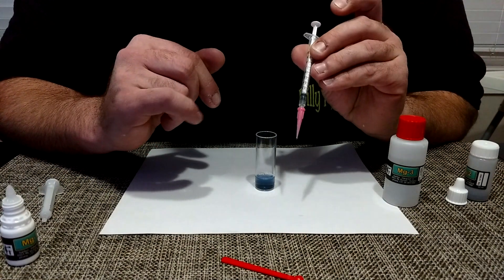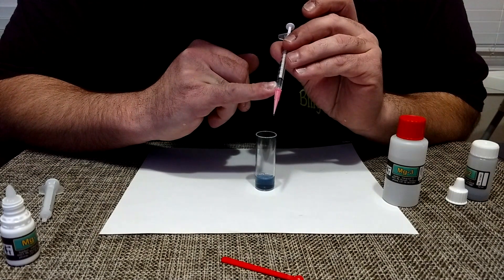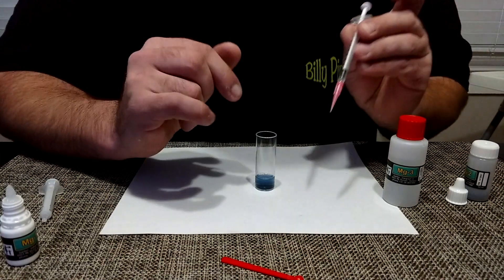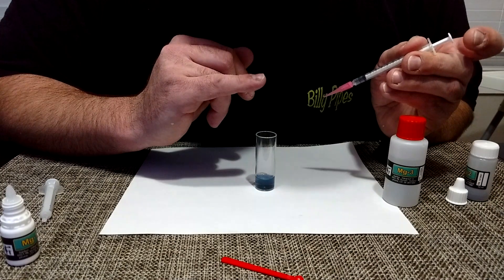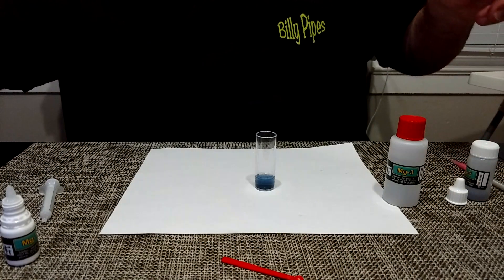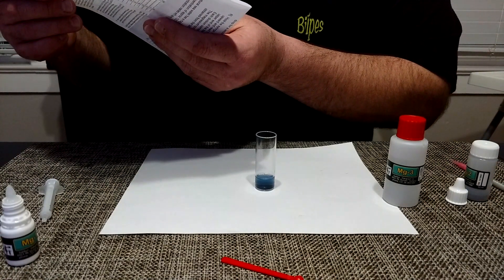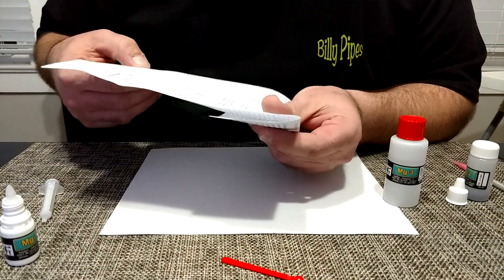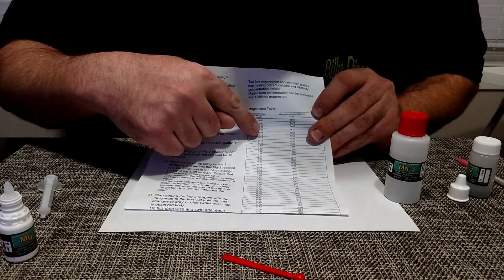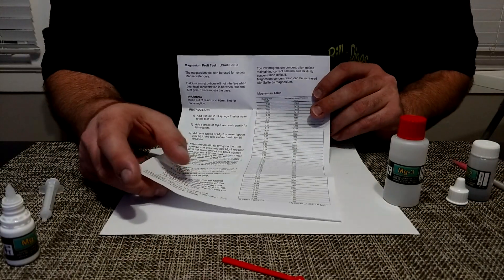You look at your syringe here — it's at 0.08. Now what you do is look at the chart. 0.08 is 1380. I like that number. That's pretty good.